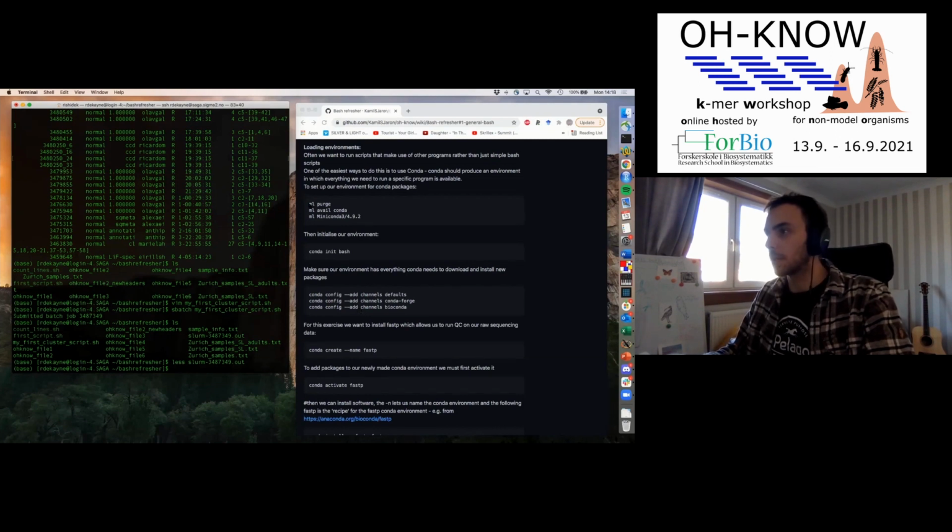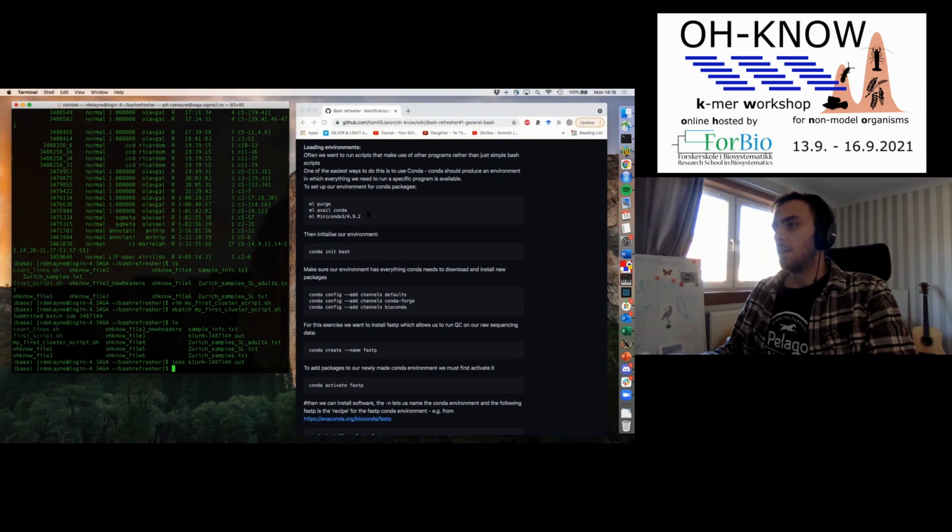I won't go through this beginning bit here, but basically what you need to do is configure your own personal environment to be able to install things on Conda. This is one of the bits which I suspect we might have some issues with, but we can fix those as and when we reach them. Basically, you want to refresh the state of your environment. This is just a good starting point, to make sure your environment is clean.